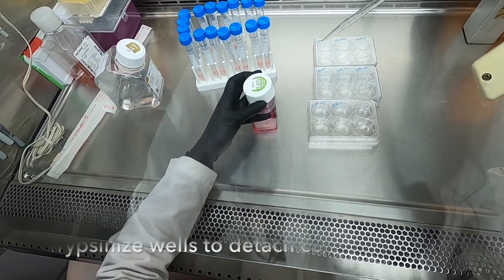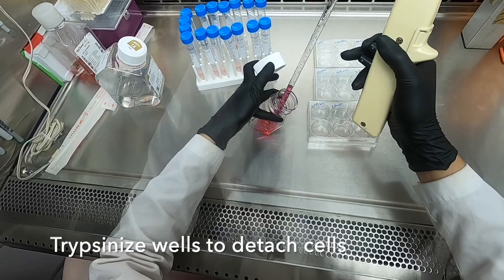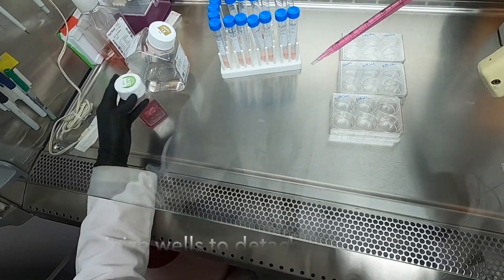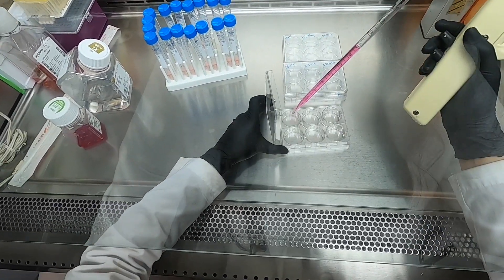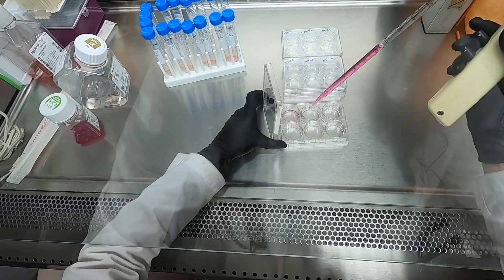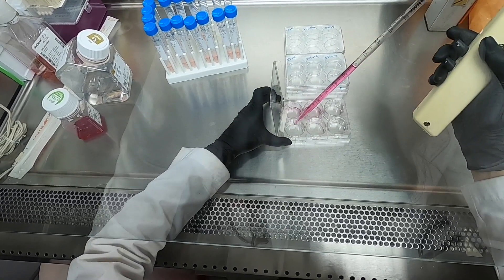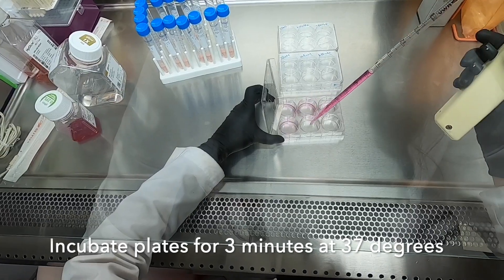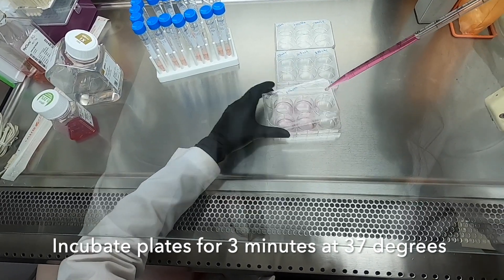Next, we have to harvest the cell from a plate. We do so by trypsinizing them with 1 ml of trypsin. We then incubate our plate at 37 degrees for 3 minutes in order to allow the trypsin to work.